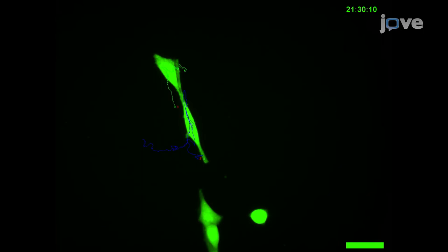To investigate the behavior of MSCs on different substrates, cell migration over a 29-hour period was analyzed using time-lapse digital microscopy. The migration path for cell 1 and cell 2 are marked by the green and blue line, respectively. As shown here, all subtypes of MSCs showed the fastest migration rate on the extracellular matrix-coated surfaces, and the slowest on non-coated polystyrene surfaces.